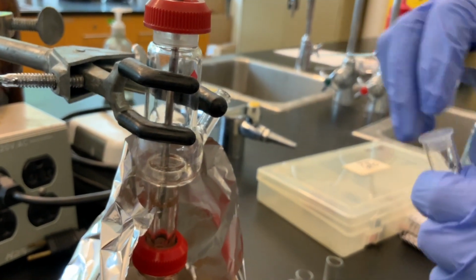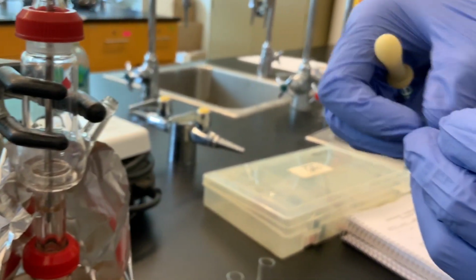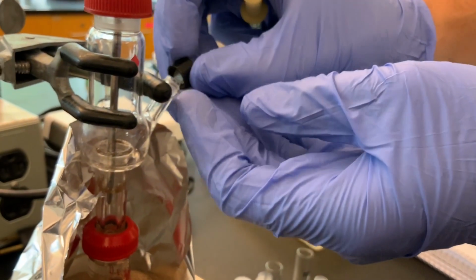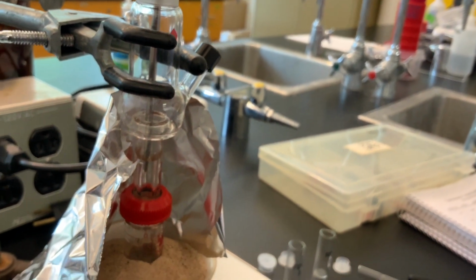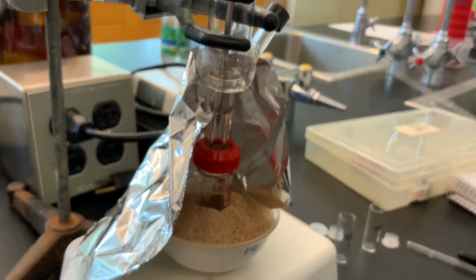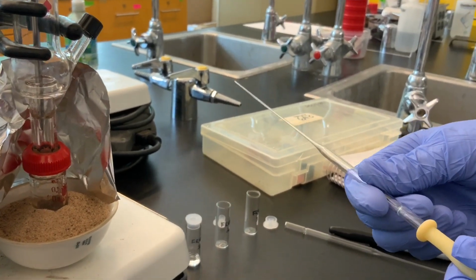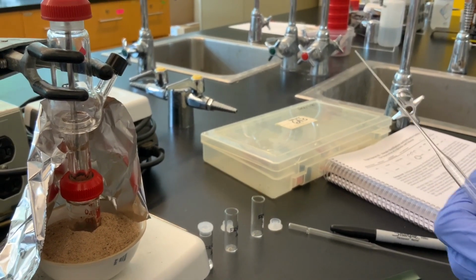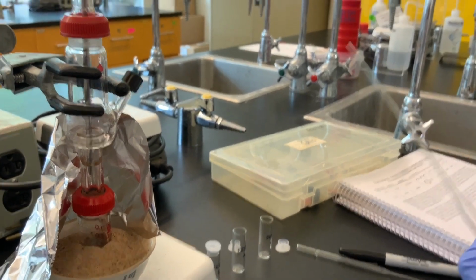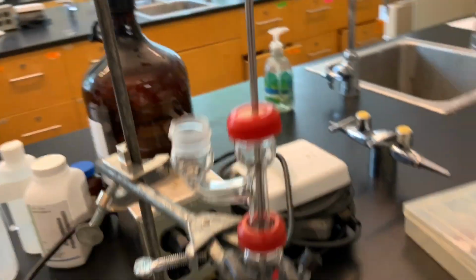Of course, I'm going to seal it so that my vapors don't go anywhere. And then I've got to quickly put my screw cap back on to now start waiting for fraction number 2. And now I'm going to replace this pipette because I don't want contamination. And we're going to see obviously now that, so we stopped at 78.3 and now we're still climbing to 81.6.